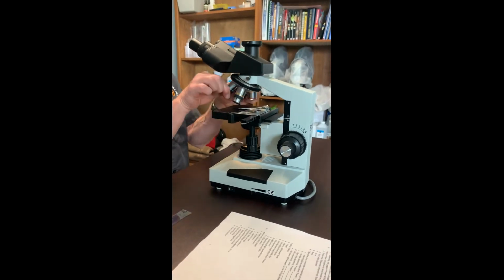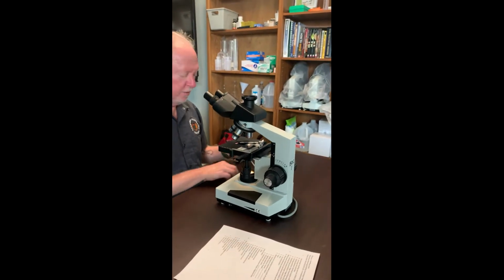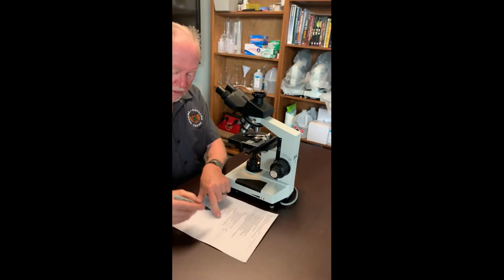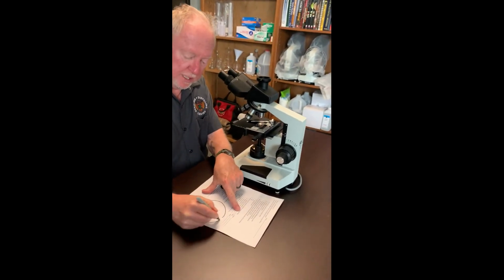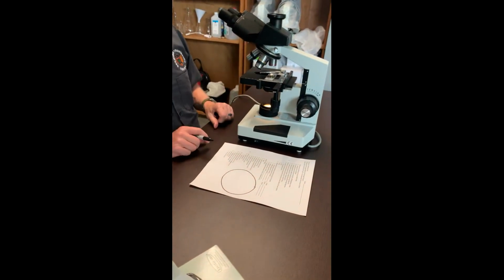Another little thing. Here's a field of vision that you're looking at. That field of vision is on the low scanning objective.